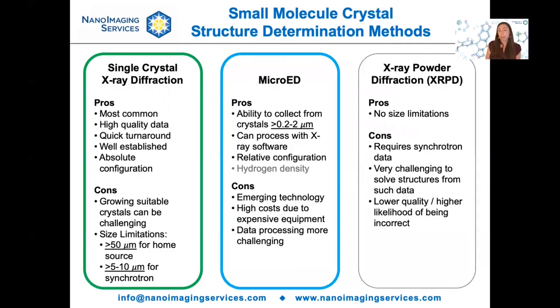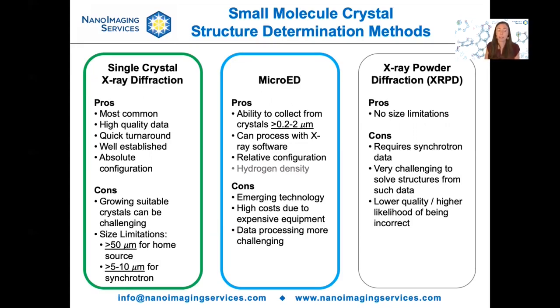When thinking about crystal determination methods available for small molecules in the pharmaceutical space, the three most widely used are single crystal x-ray diffraction, micro-ED, and x-ray powder diffraction. Single crystal x-ray diffraction is hands down the most common method used. It produces really high quality data and has very quick turnaround times. It's a very well-established field and is definitely the method of choice if you have large enough crystals. The big con is that you do need large enough crystals — typically about 50 microns or larger for a benchtop diffractometer, or slightly smaller for synchrotron sources, though not every group has synchrotron access.